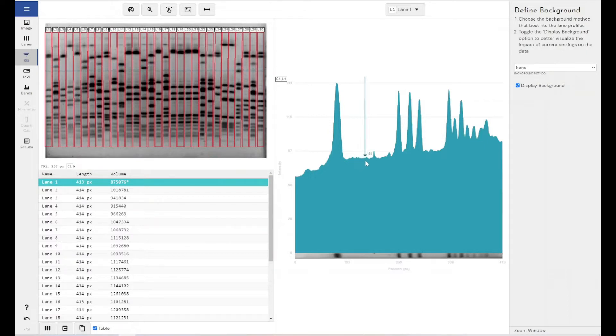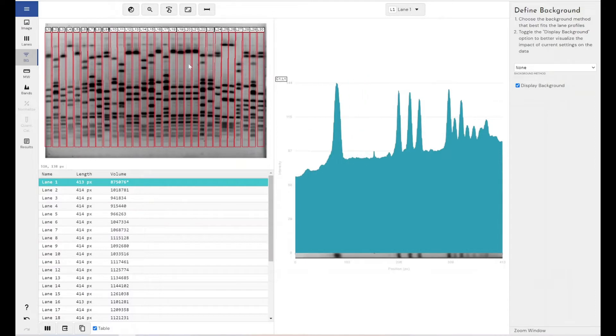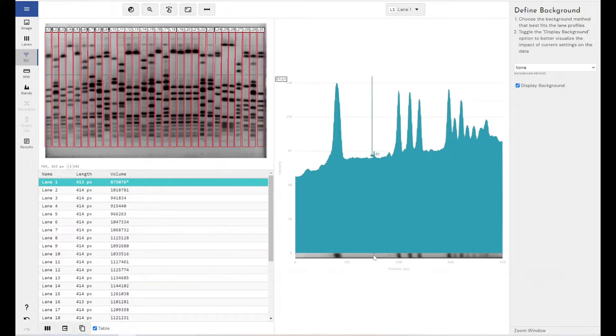You can see here this area would be considered background and it relates to this grey area within our image here where we don't have any areas of obvious signal. You can see it here.